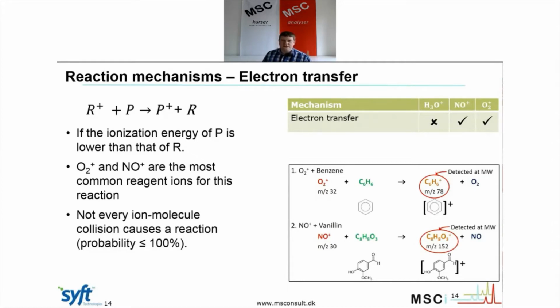Opposite of proton transfer, here we don't have a 100% probability of the reaction happening in a collision.